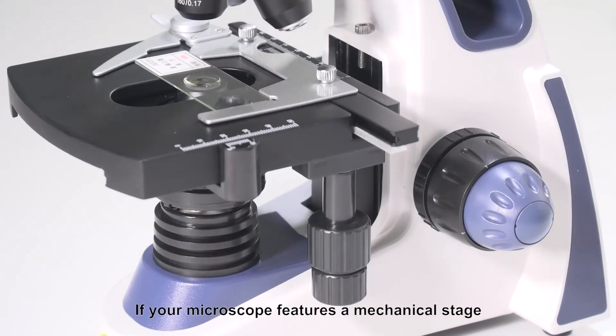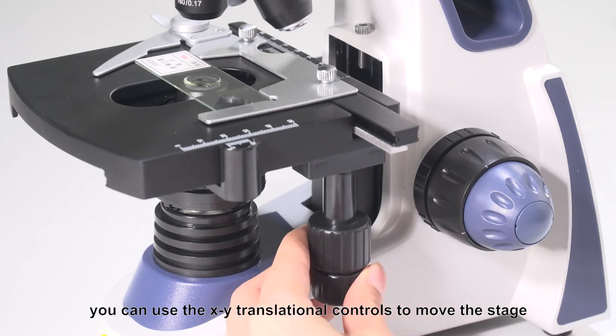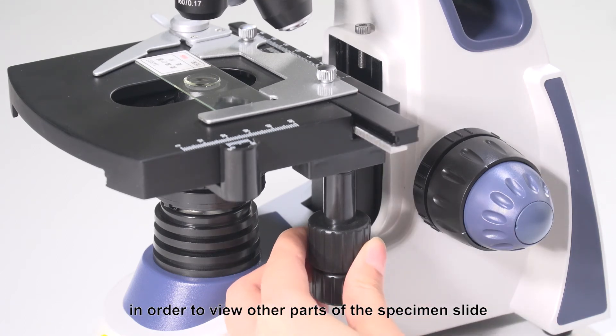If your microscope features a mechanical stage, you can use the XY translational controls to move the stage in order to view other parts of the specimen slide.